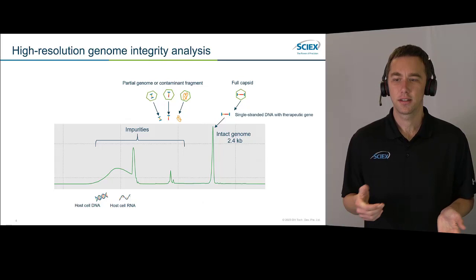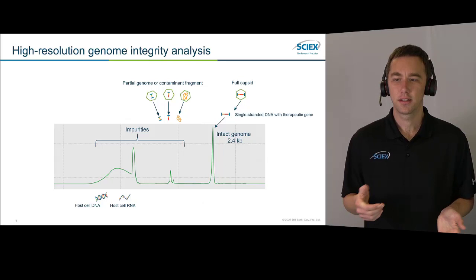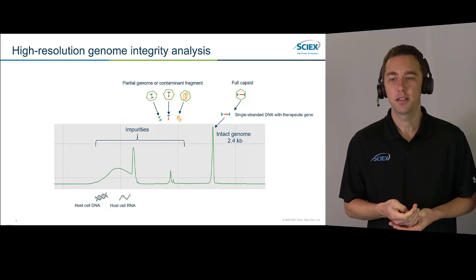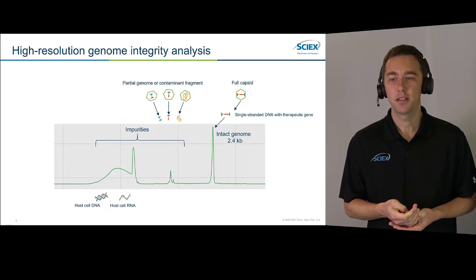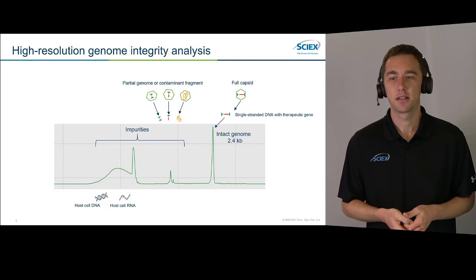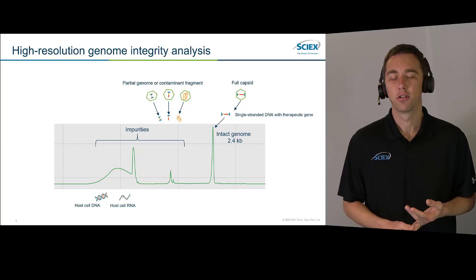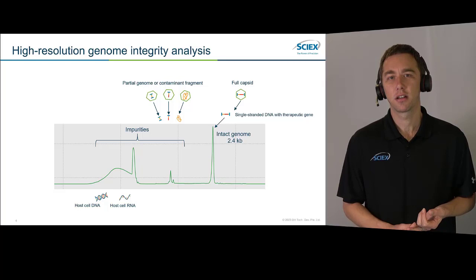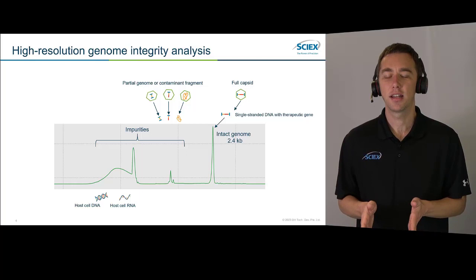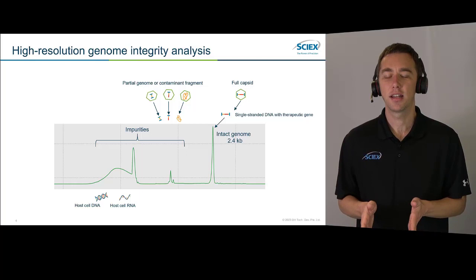Here we have an example electropherogram of an AAV genome of about 2.4 thousand bases. We can see the main peak running right at about 2.4 kb, and then we also see a lot of smaller related substances. Those related substances could be partial genome, truncated genome, or contamination fragments. We might even have host cell DNA or host cell RNA that got co-purified with our sample. We need to monitor all of this and try to keep it to a very low abundance so that we have the highest amount of intact genome.